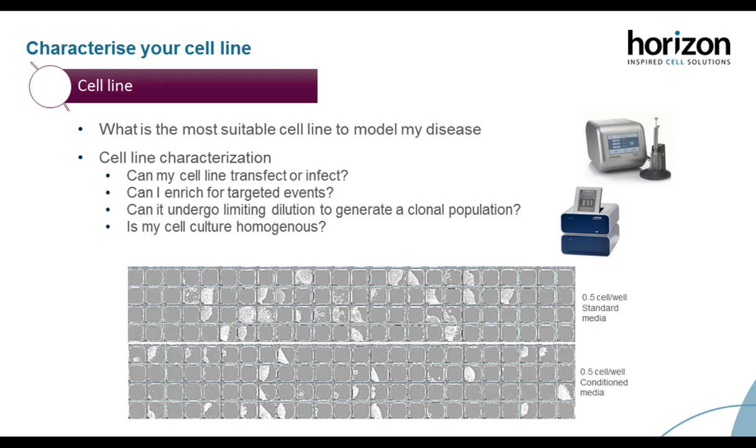So it's just about knowing throughout your procedure that you're not selecting for one of these different phenotypes within your cell lines, because you want to be capturing the whole population, and then finding out later on that because you've captured those two different phenotypes in your cells, that has no effect on the gene that you're knocking out or modifying.